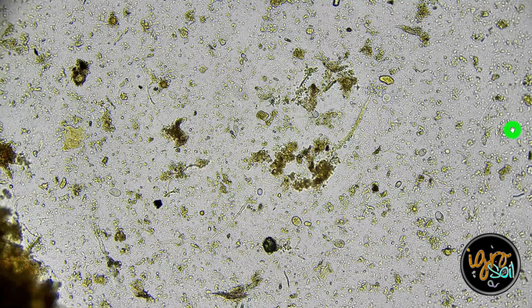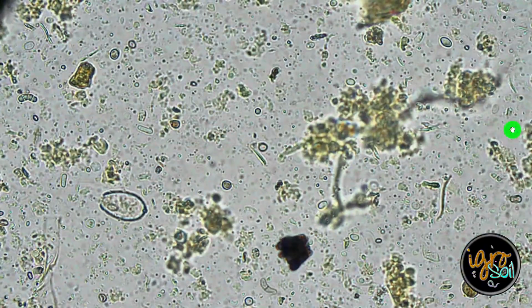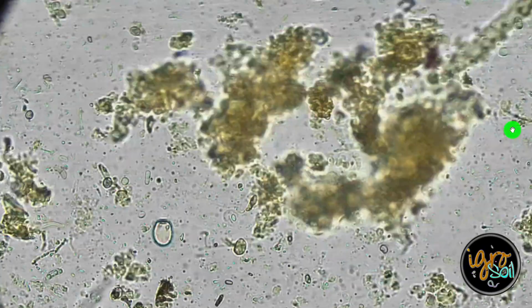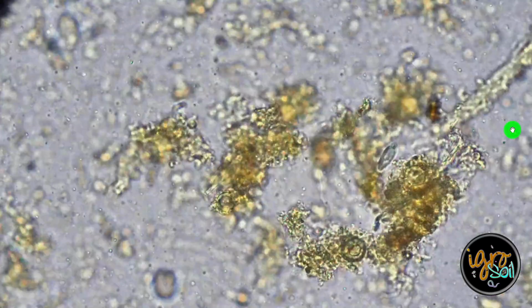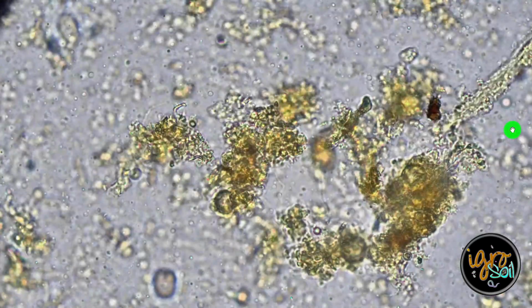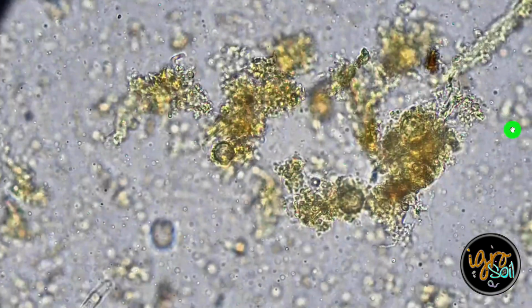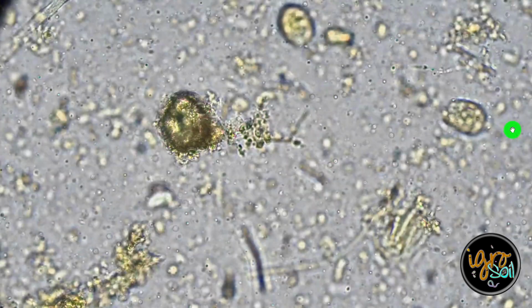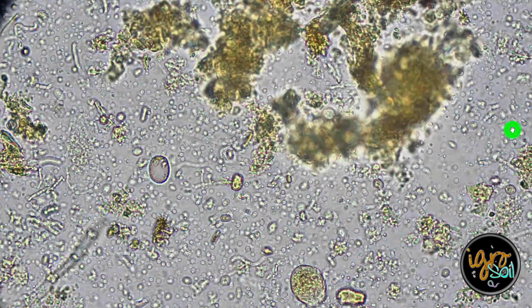I think that's like a microarthropod moving around there. Let me see if I can catch up to him. He's just kind of chomping away. There he is. He's moving so fast. Or is that a ciliate? I can't tell. He's actually a little deep too. Yeah, I'm gonna guess that's a ciliate.